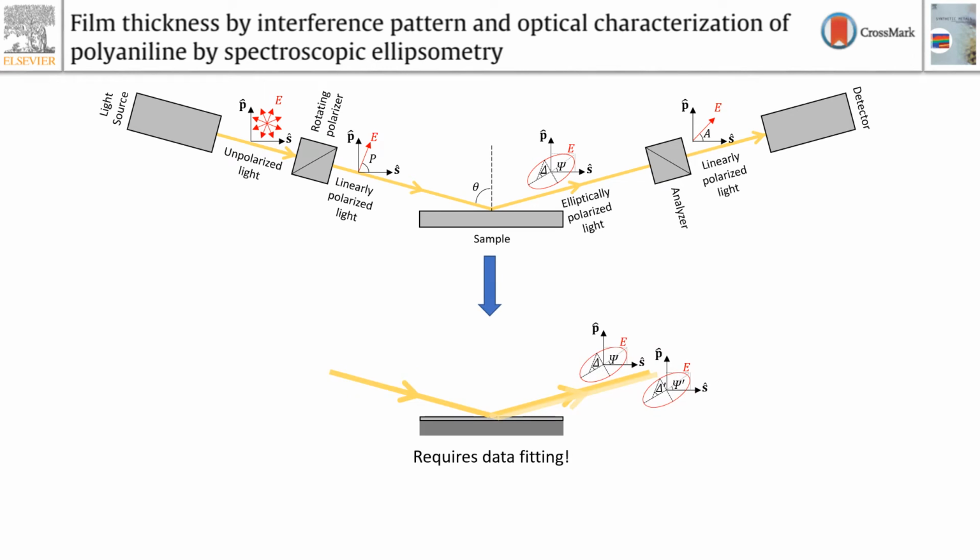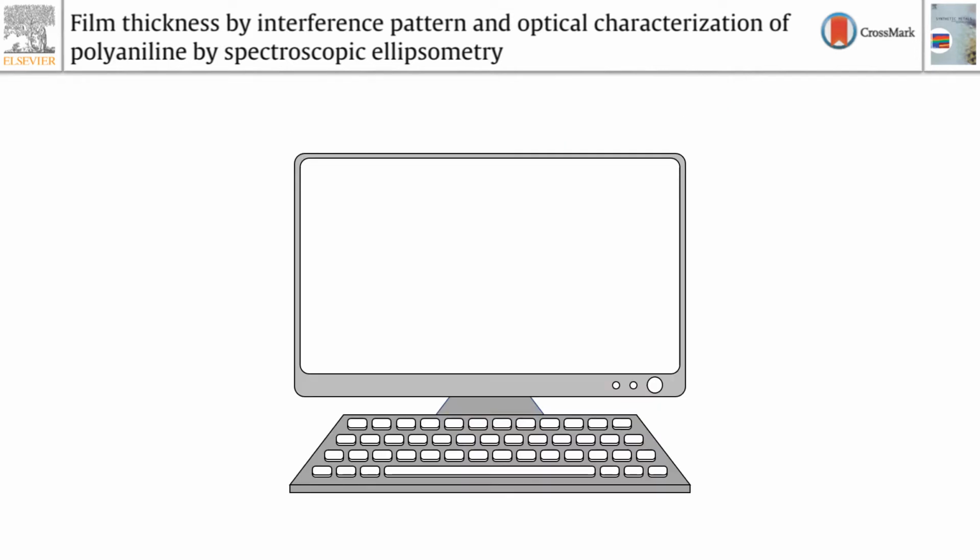However, in the more general case, the sample is so thin that even being absorptive, the top and bottom light go through the detector. In such a case, the optical properties can only be achieved by means of computational methods, which require model definition and parameters variation in data fitting process. Data fitting is not easy, and in some cases can take months until it becomes reliable. It consists of 6 steps.